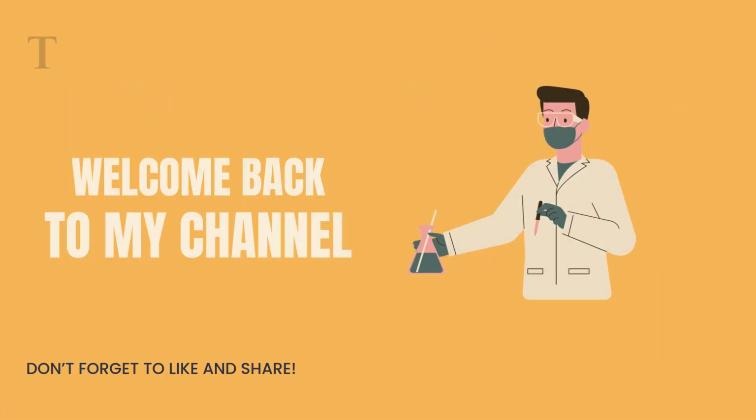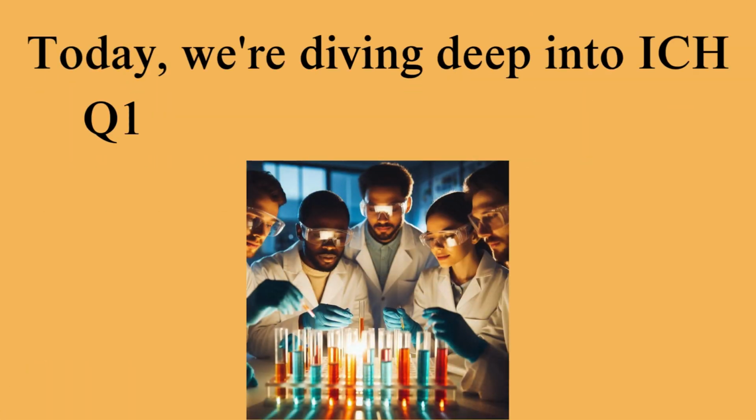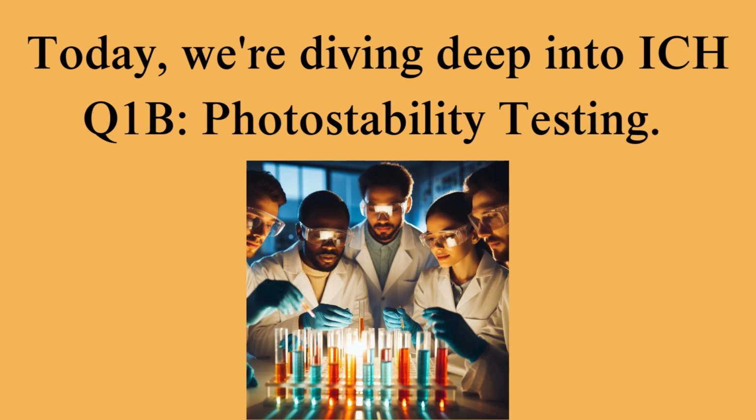Welcome back to the channel. Today, we're diving deep into ICH Q1B, photostability testing.